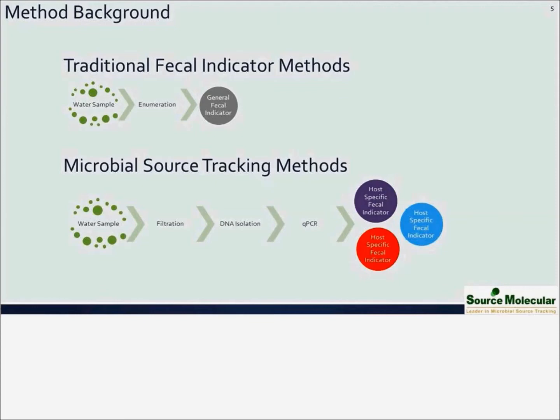This gives you the rundown of the last 30 years. Where are we today? The vast majority of laboratories are using this qPCR-based approach to tell what are not only general bacteria levels, but also what are the hosts causing that. I'm not going into the science too much in this presentation because there have been other presentations that go more deeply into how all of this works. But what you need to know as a practitioner is that you will get an idea of what is causing the pollution. So this sums up 30 years.